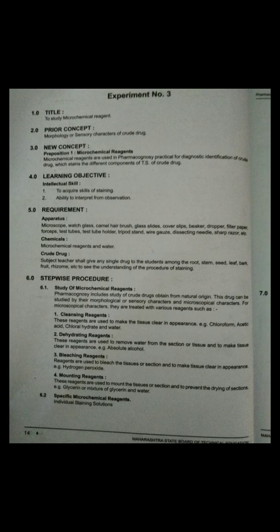Now I will start the stepwise procedure. First is the study of microchemical reagents and second is the specific microchemical reagents. Pharmacognosy includes the study of crude drugs obtained from natural origin. These drugs can be studied by their morphological or sensory characteristics and microscopical characters. For microscopical characters, they are treated with various reagents such as cleaning reagents, dehydrating reagents, bleaching reagents and mounting reagents.